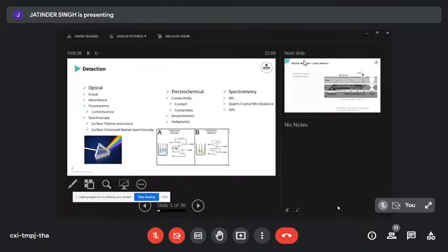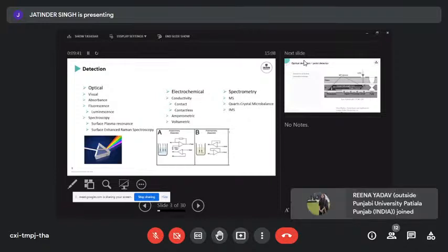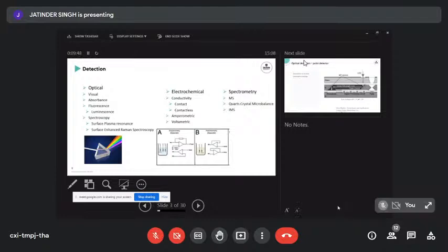And then there's spectroscopy. So we already have seen some surface enhanced Raman spectroscopy coming by yesterday, where we had those pillars with the little silver nanoparticles sitting on top. So SPR and SERS have been done on microfluidic devices as well. I've already kind of alluded to the fact that electrode integration is easy. So electrochemical detection methods are really popular for integration on microfluidic devices as well.